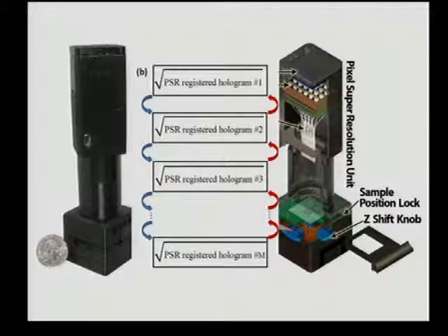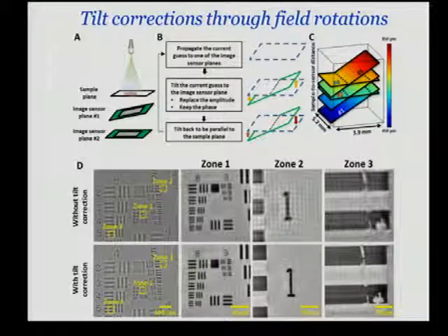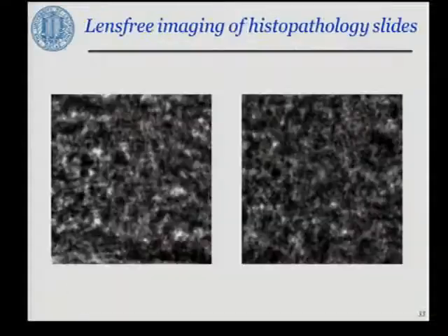But as you propagate and go back and forth among different planes, you refine because you know the measured amplitude and you retain the phase. It's always about retaining the phase and feeding a measurement. This is very robust. And if you combine this with corrections of plane angular mismatch between different planes, it even becomes more aggressive in convergence to essentially the correct solution, even using a simple field portable design.